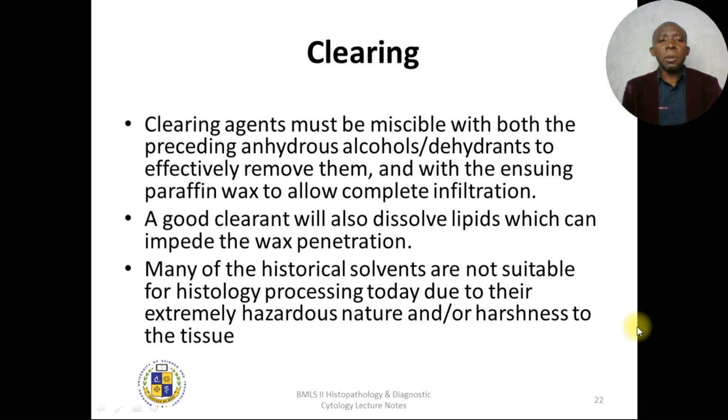So apart from dehydrating, we go to our next step. You remember we said you are going stepwise. We started by fixing. From fixing we went to dehydration. These are the steps which follow each other chronologically, and we are now on the next step, which is clearing. So clearing agents must be miscible with the preceding anhydrous alcohol, which is a dehydrant, to effectively remove it.